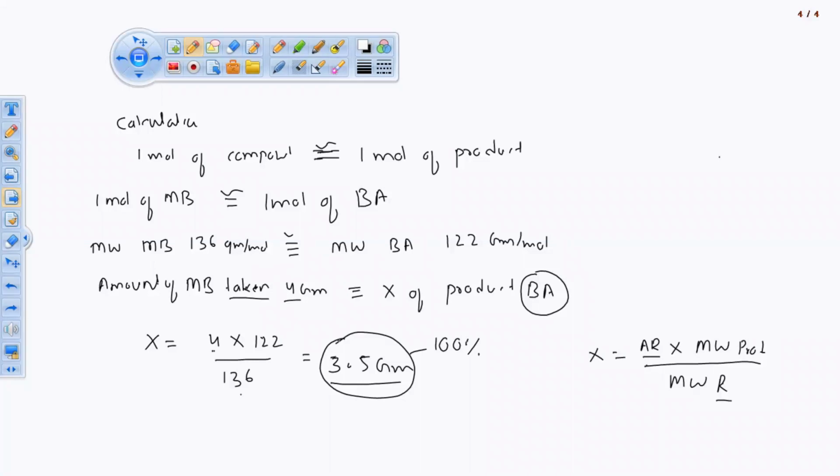If you are following proper protocol, you are going to get your proper compound। अगर आपने प्रोटोकॉल अच्छे से फॉलो किया, अब ये ज्यादा आ गया, if it got exceeded, it shows that the student had not followed the protocol of the given reaction। अगर आपने प्रोटोकॉल नहीं फॉलो किया, वहां पे आपके मार्क्स रिड्यूस हो जाएंगे. कम दिखा दो, it's okay. But the variation difference does come, if it is less then it is okay, but you have followed the protocol, it should not exceed 3.5, theoretically.